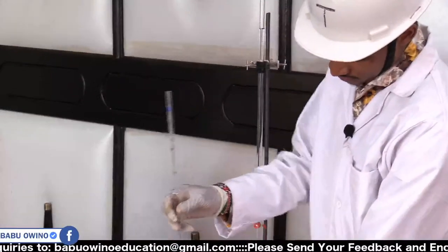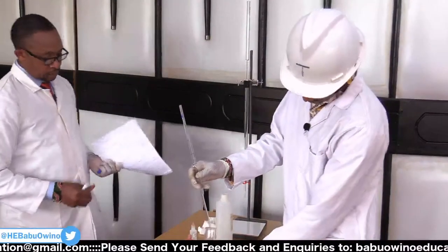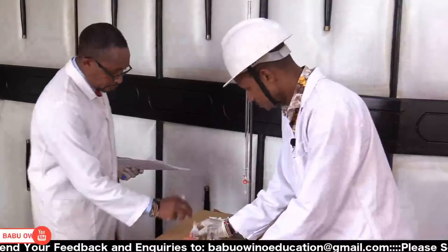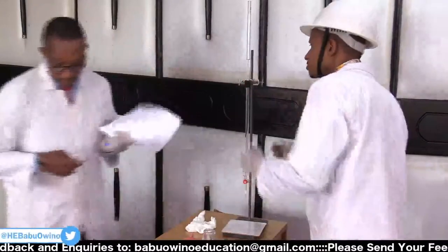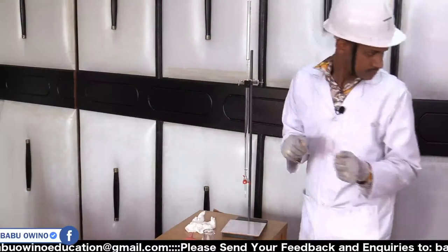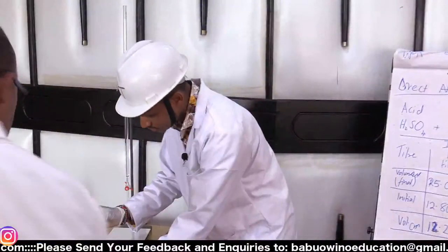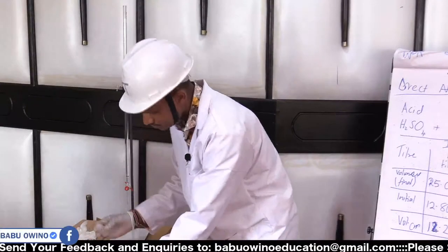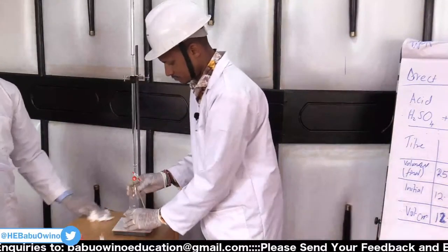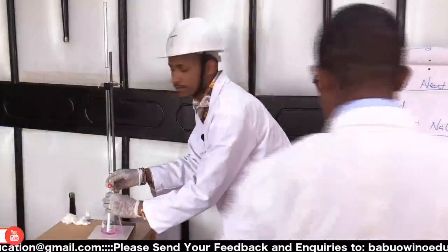So our initial reading has changed. Okay. Read the initial first. Watch out. Read first. Now the initial value, the graduation, is 14.3. Now you put 3 drops. Yeah. We need to go 29.3. So I've made a mistake. No, it's okay. No, this one. Then? This one.